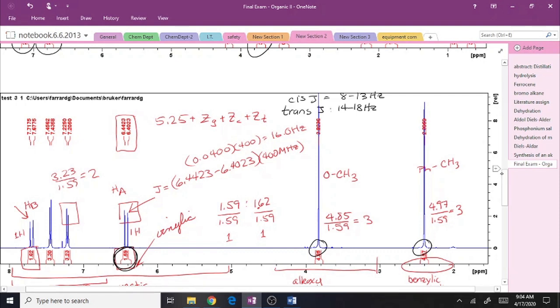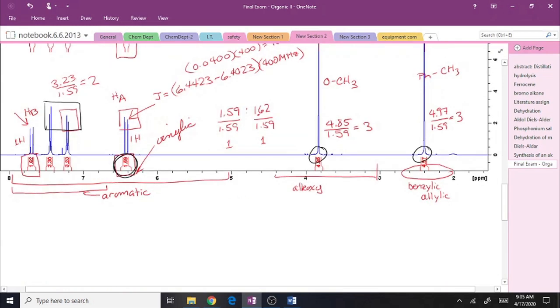This will actually be useful if you have a reaction and you're not certain what the product is. If you look at the spectrum and you can interpret it, you can work backwards and get that structure. For example, with this one, again, we have this pair of doublets integrating to 2 each in the aromatic region. That pair of doublets, as I've mentioned, if you're in an aromatic, indicates that you have a para-disubstituted compound.